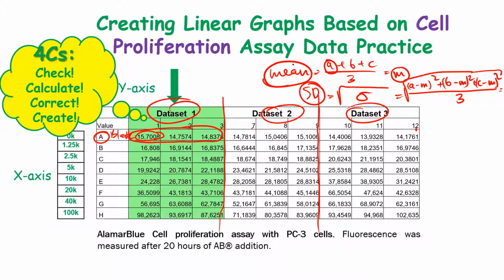And it is needed to identify a special coefficient of variance. Usually it's written like this. And this coefficient of variance would be equal to standard deviation divided by mean. And this value should not exceed 10%. If it is exceeding 10%, then you most probably have some outlier here.